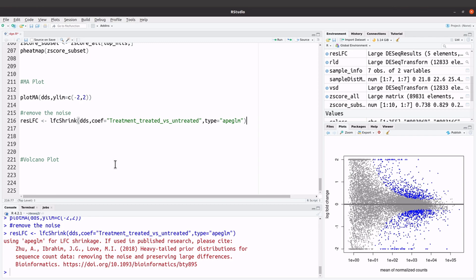Now we have done that. It's advisable to remove the noise and then generate the plot — that's what we have done. You can check the DESeq2 documentation and look at other ways of generating MA plots. That's how we generate the MA plots.